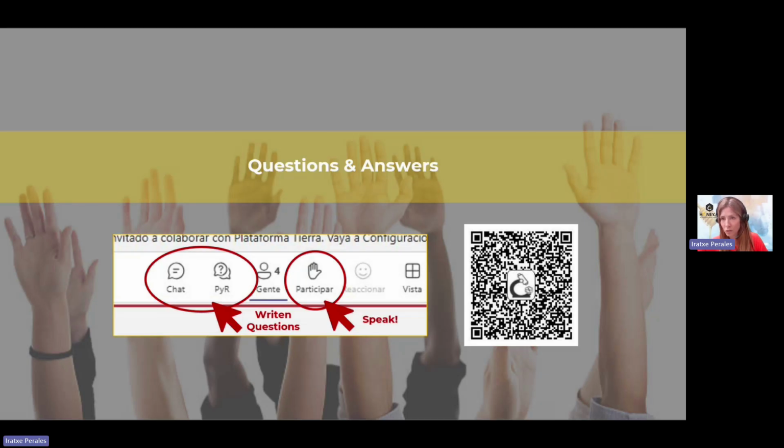How do you provide the results considering pollen types? I think I already explained that. Again, we provide the results exactly the same as another laboratory. You can go to the website and you will see. We usually provide pollen type, and in case of monofloral honey, we provide the flora that is represented by the corresponding pollen type. Yes, this is our answer.